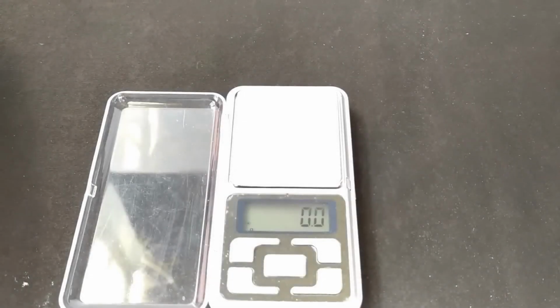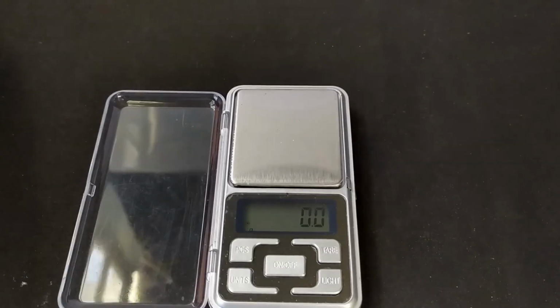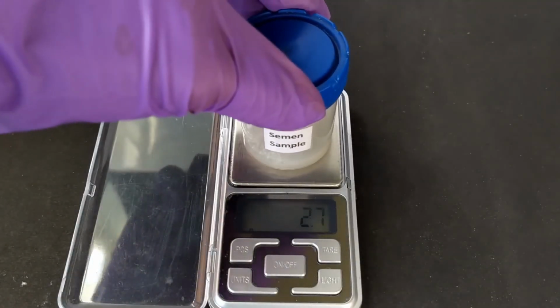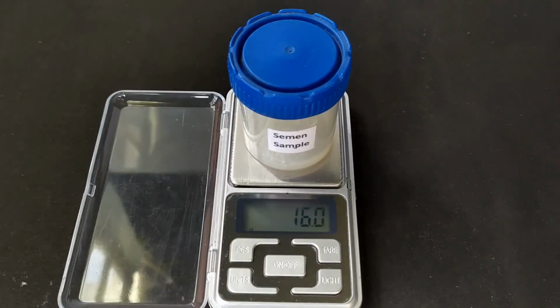A third method, which is also considered the most accurate method according to some published papers, is to directly weigh the sample in an analytical weighing scale. 1 gram is generally agreed to correspond to 1 ml of the sample. This method eliminates the loss in volume when transferring the sample from the collection container into the measuring receptacle. One important point to keep in mind when applying this method is to note down the weight of the empty container prior to sample collection.